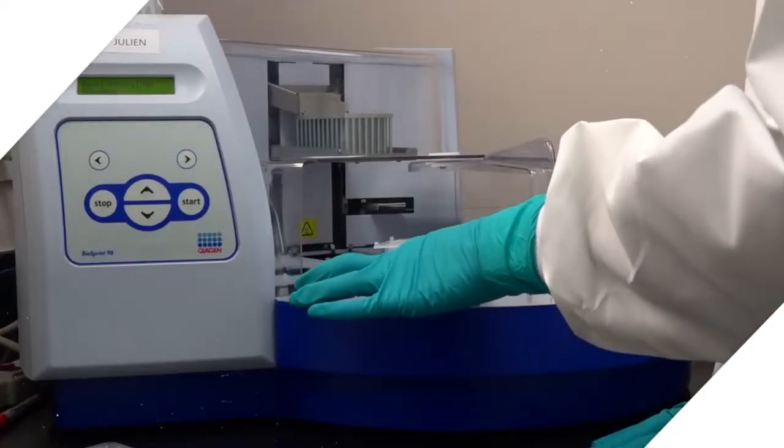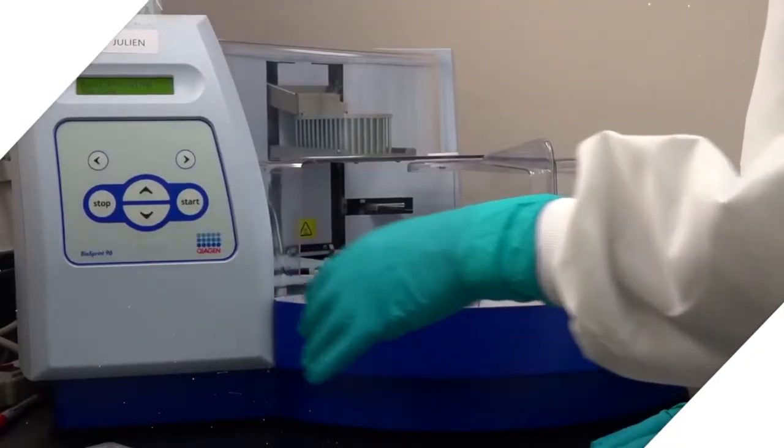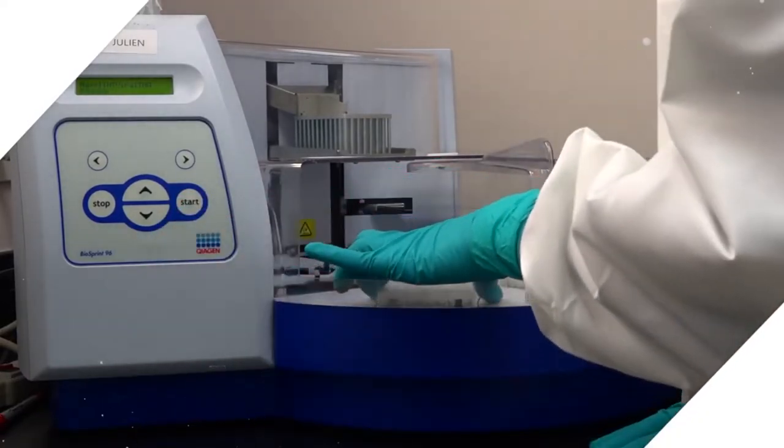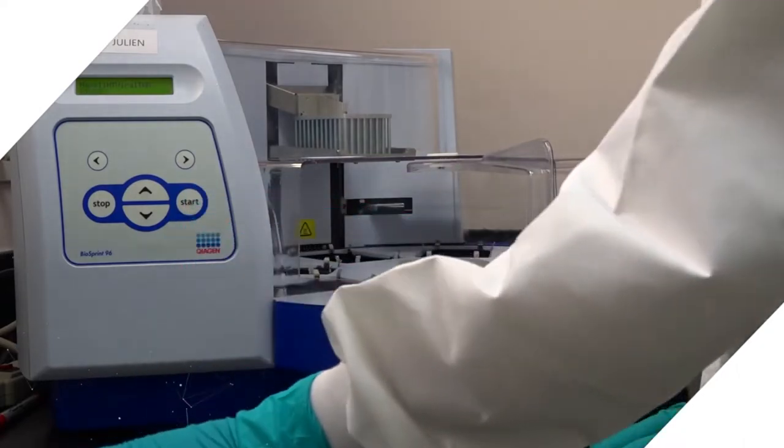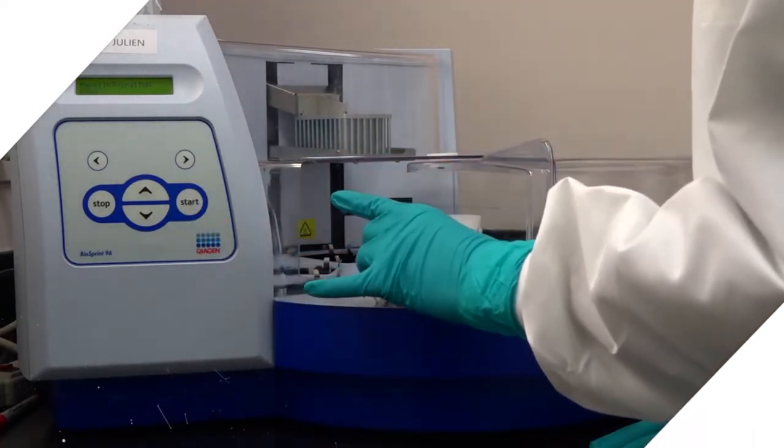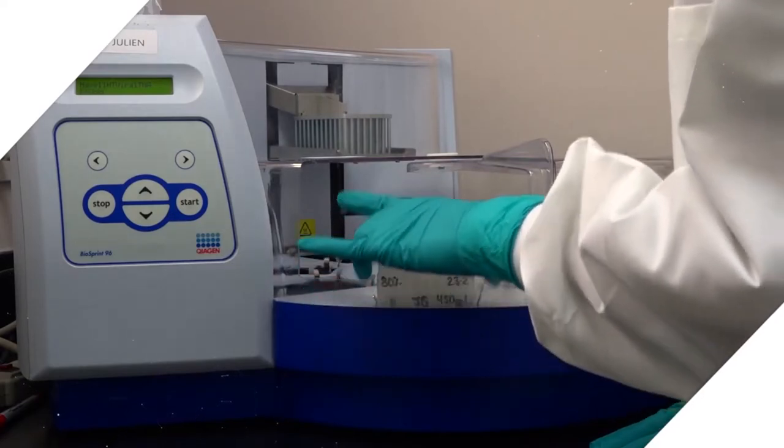We have to ensure that the kits that we're using are up to standard, so we have to validate them, we have to get samples to be able to do that. It's just building good quality assurance to establish good quality assurance practice and procedure to ensure that the end result of our testing is of sound quality and can be relied upon consistently.